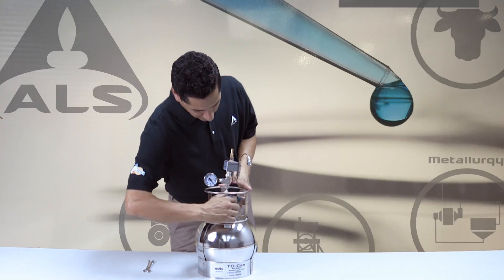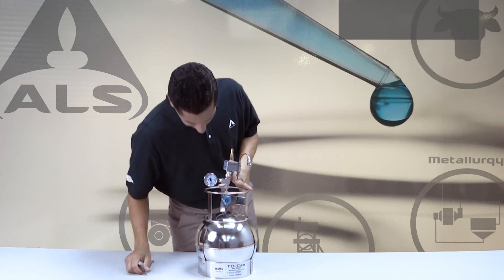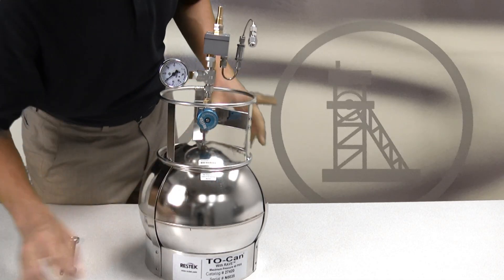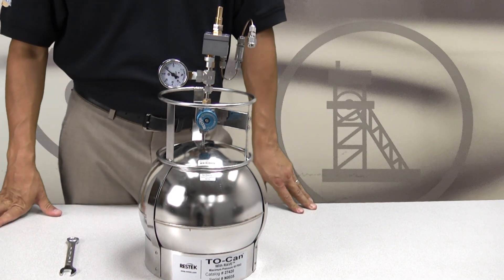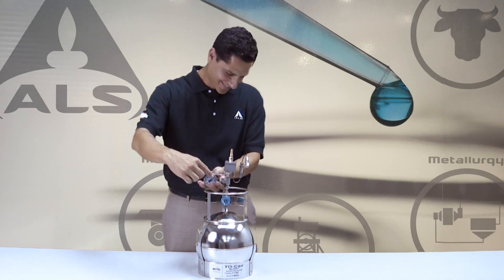After the time has elapsed, turn the valve clockwise one-quarter with your fingers to close. Monitor the vacuum gauge for approximately three to five minutes. If the vacuum gauge shows a pressure change of more than one inch of mercury per minute, a fitting is loose. Retighten all fittings and continue to monitor the gauge.